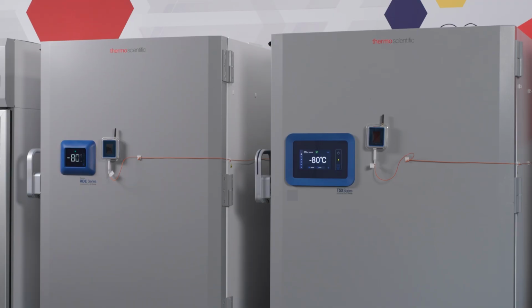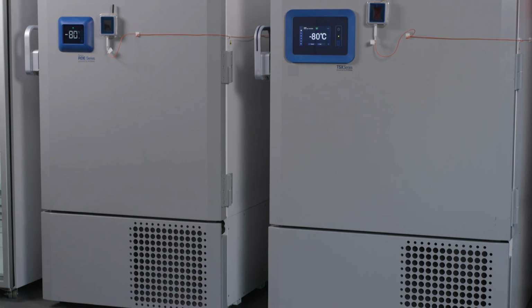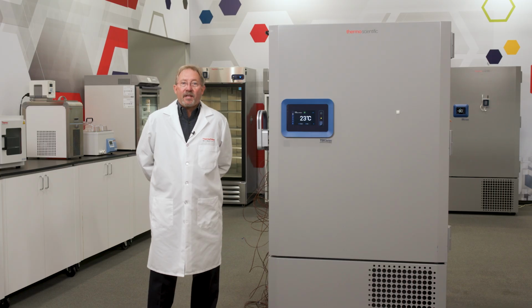So there you have it. A few tips that might help you avoid some of the common mistakes being made that result in unnecessary test failures. There is nothing more aggravating than failing a test only to find out that the freezer you ordered was not the correct freezer for your application, or there was a problem with the process or setup and not the freezer. Once you get a proper and robust plan in place, mapping won't be such a headache for you. You will experience a huge increase in successful tests that truly reflect the condition of the freezer, which is the whole point of the exercise.